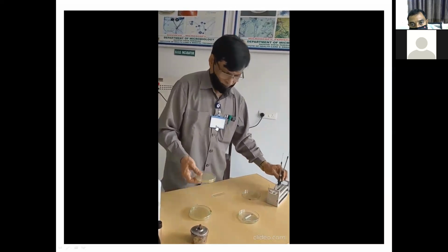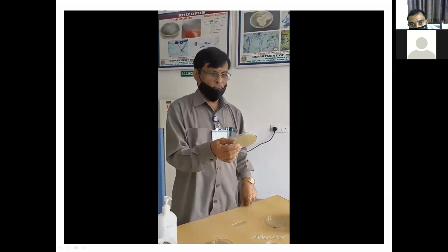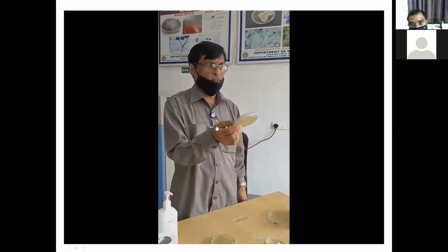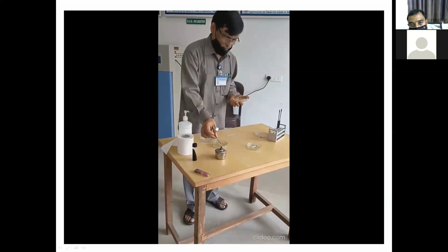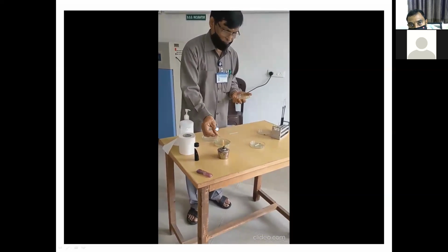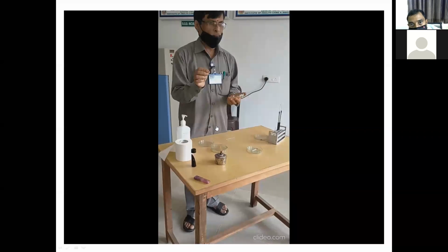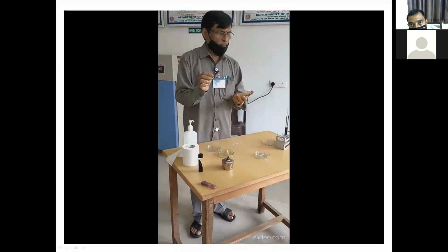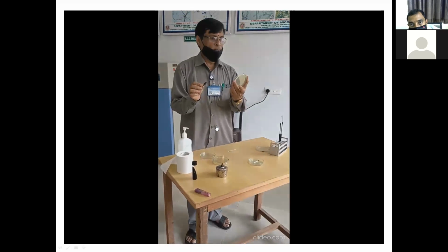We will take the Sabouraud dextrose agar, which is a necessary medium for the growth of fungi, in the flame of a spirit lamp. Wait for some time for it to become cool, and cut 1 centimeter square from this plate.